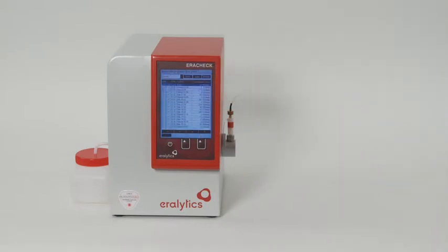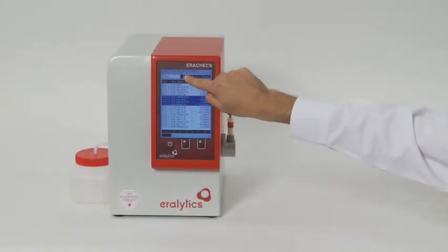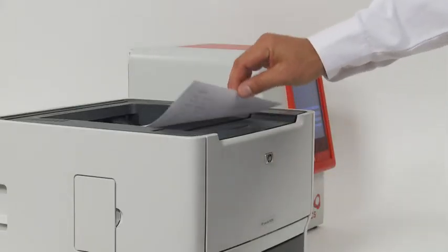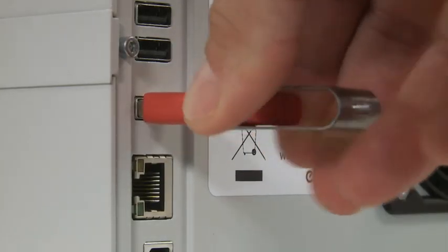In the result menu, several thousand results can be stored and reviewed. Simply go to the result menu — each line displays a result. Browse through the result memory using the cursor keys. At the bottom of the list, the data can also be printed on a directly connected printer or via Ethernet connection to a LAN or network printer.